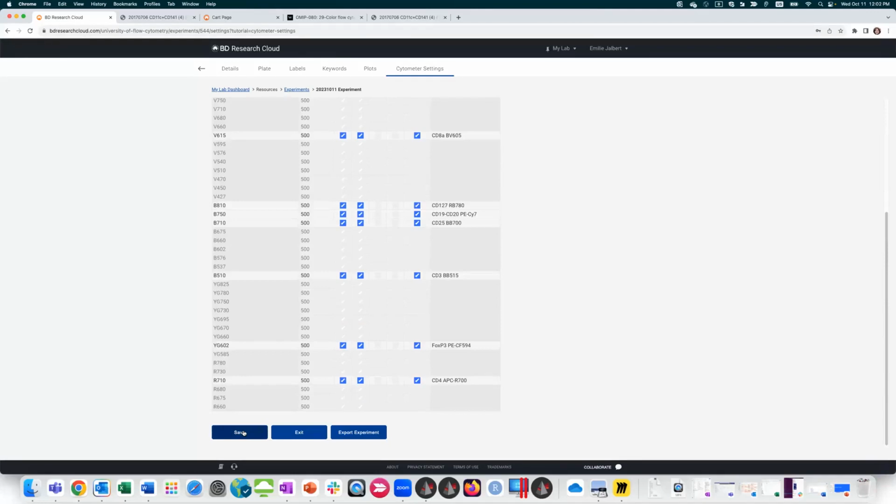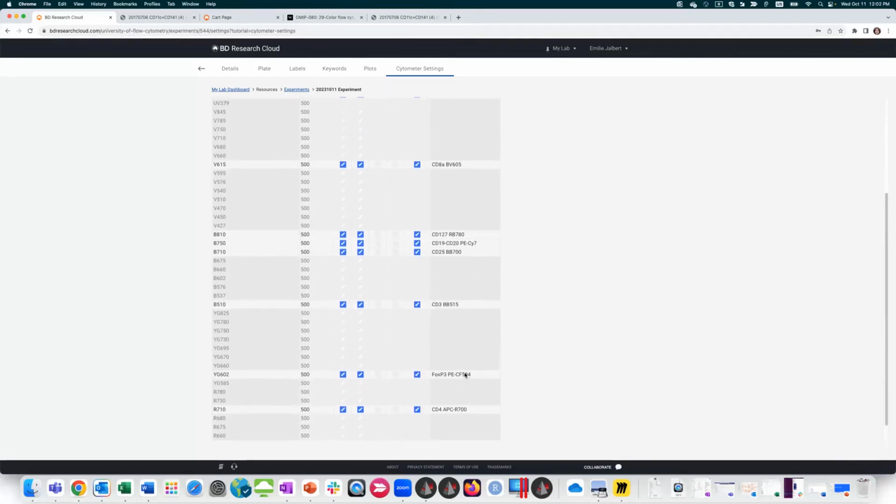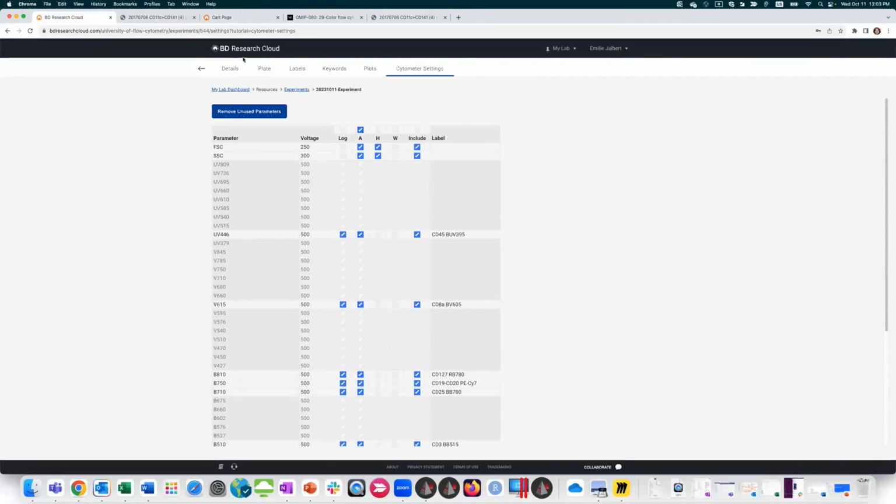So this is a nice time saver, especially if you're paying per time on the cytometer, you don't have to spend time labeling your samples. You can do that ahead of time and save how much time you spend on the cytometer. And this is also good for core lab managers to encourage use, because then it'll give you more users per day for your cytometer if they're not just sitting there labeling their samples, if they're actually acquiring samples.